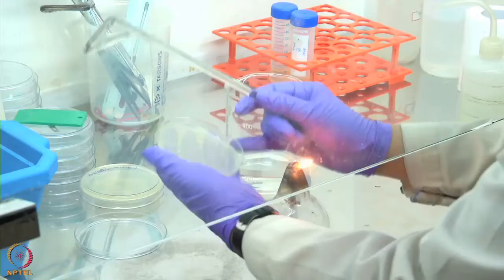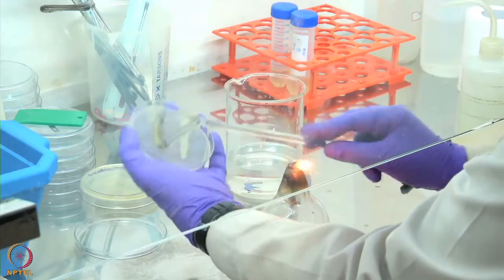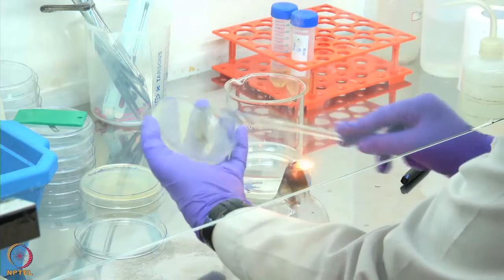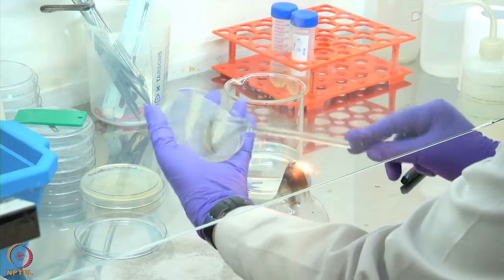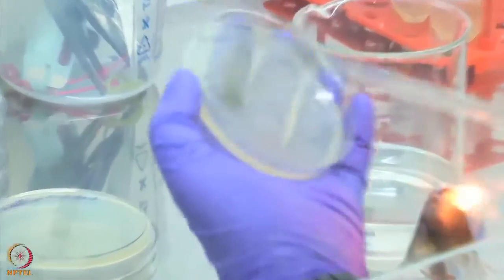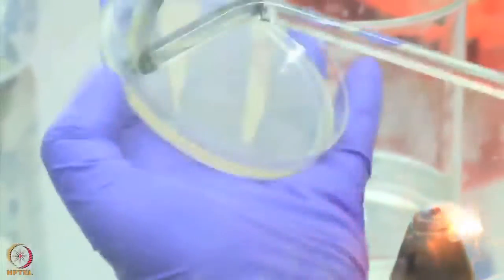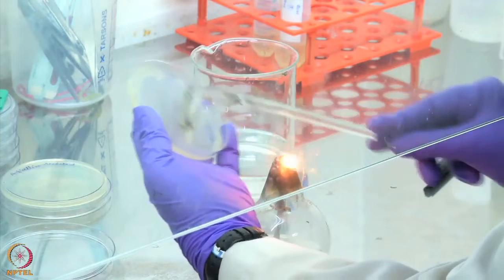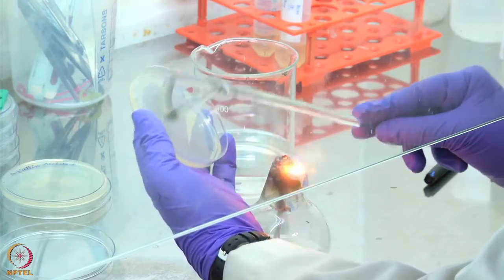Now I will start plating. I will be doing the plating in circular motions so that the sample is spread uniformly. I will do it till a point where I feel that the entire sample is spread uniformly, and when the agar seems to look a little dry and there is some friction, at that point I will stop. One needs to ensure that we do not press it too hard, else we may end up breaking the agar plate as well.